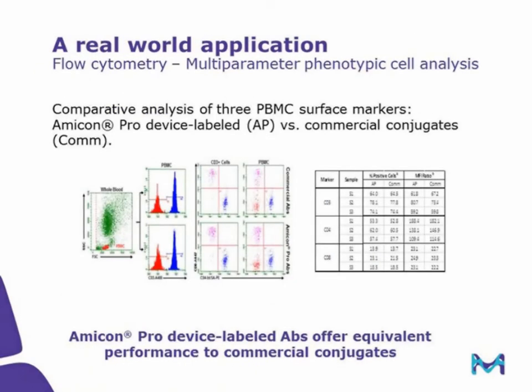Flow cytometry is commonly used for phenotypic analysis of cellular subpopulations and complex biological samples. The degree of fractionation permitted is dependent on the availability of antibody conjugates bearing spectrally distinguishable fluorescent tags. Reliable determination of distinct subsets is further dependent upon highly specific, bright antibodies offering a significant difference in mean fluorescent signal intensity between positive and negative fractions.